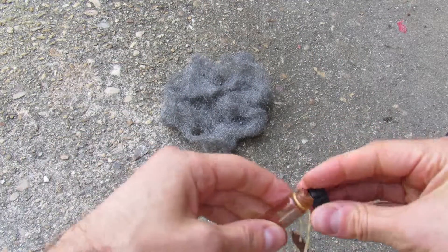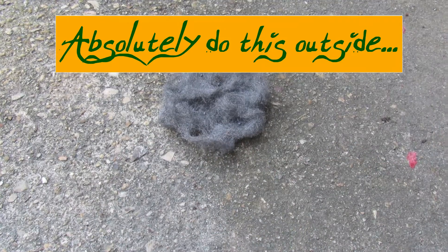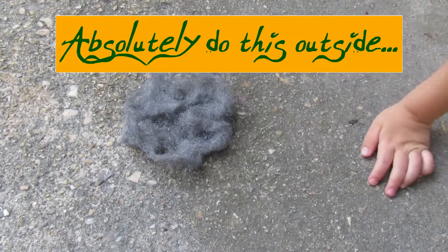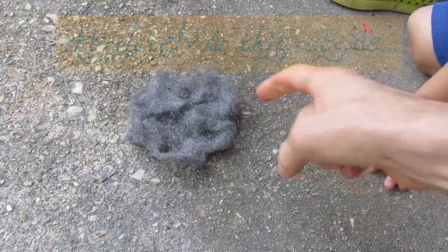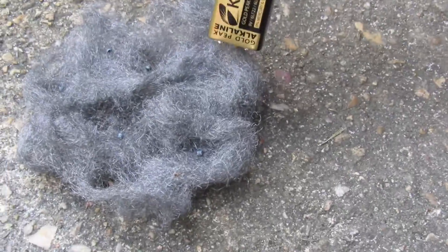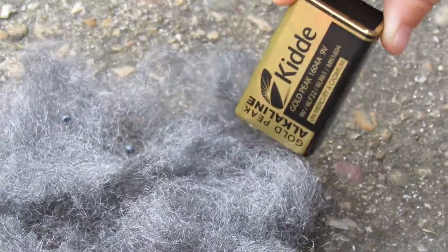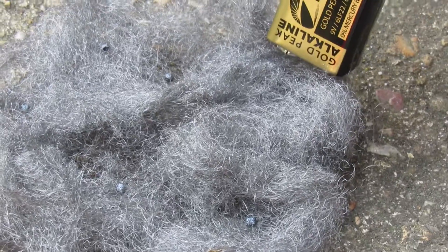My assistant Matthew is going to take the battery and touch it to the steel wool. Let's watch what happens — anywhere, just start it over here. With the 9-volt battery, there should be some orange balls of fire that start propagating through.